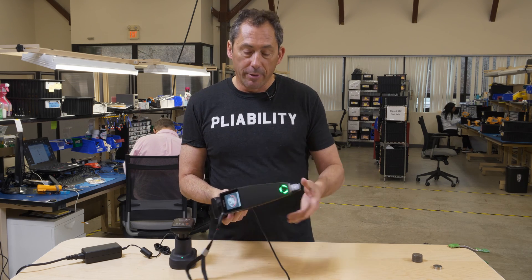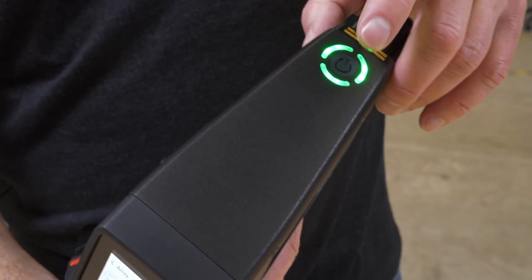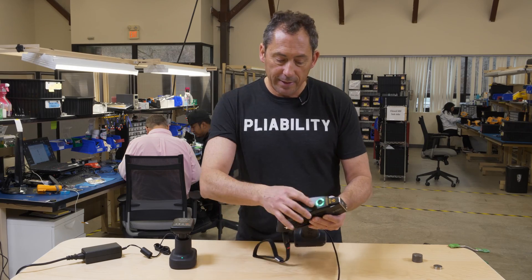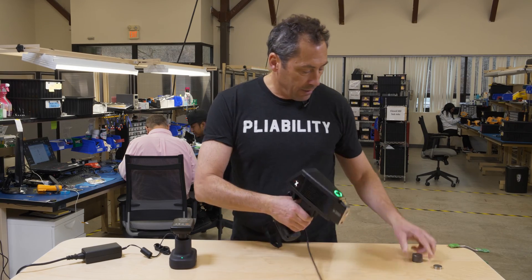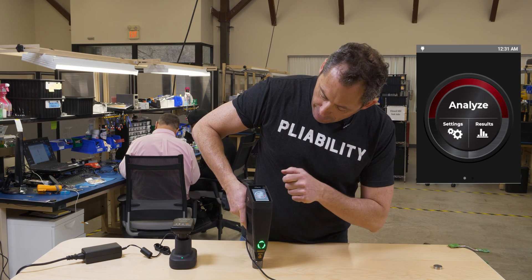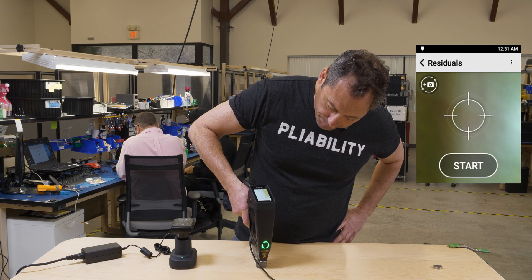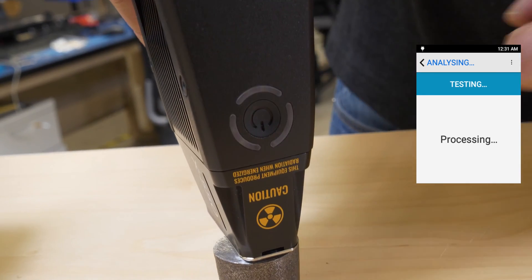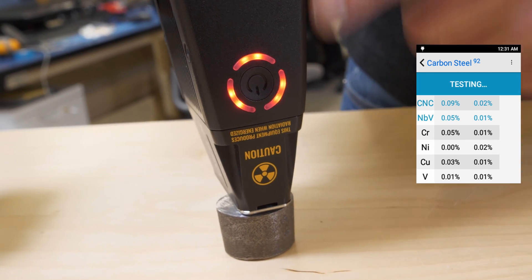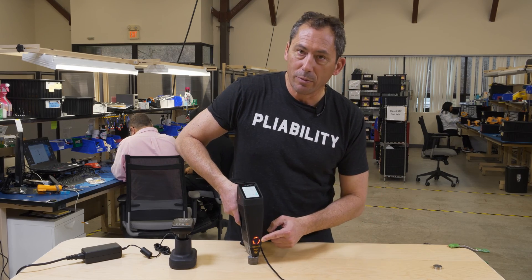Besides USB, the unit has Bluetooth, Wi-Fi, and GPS, so you can get data off wirelessly as well. The power switch shows a bright green indicator when the unit is on — press it and it boots up in about 10 to 15 seconds. When you're testing a sample — go to Analyze, go to Alloy — the indicator light blinks red during the testing, which is required. When it's not emitting x-rays but the tube still has power, it's solid red, and it stays solid red until the tube is powered off.